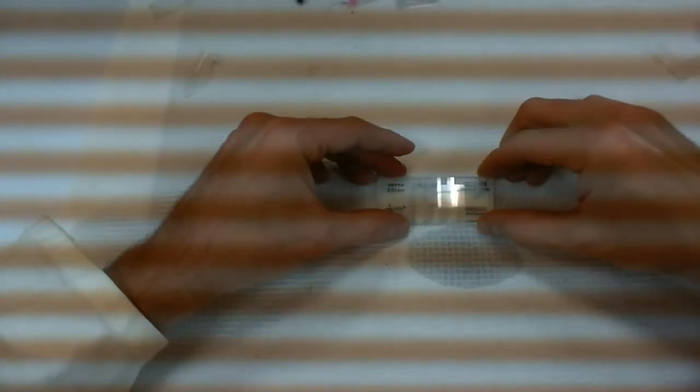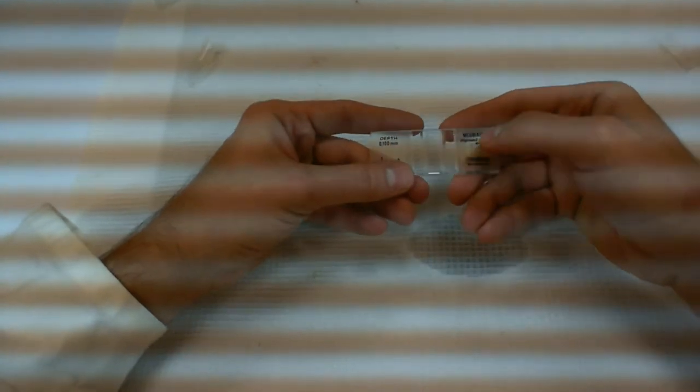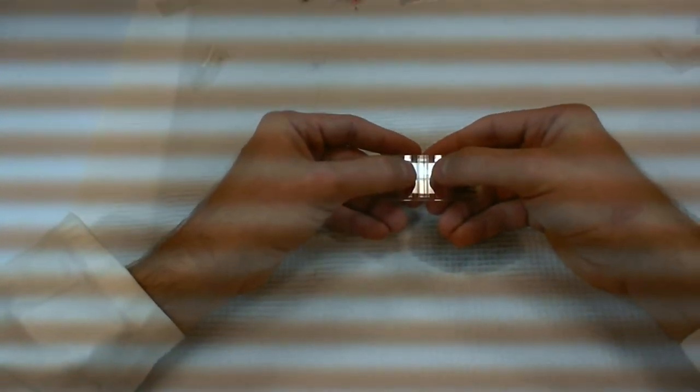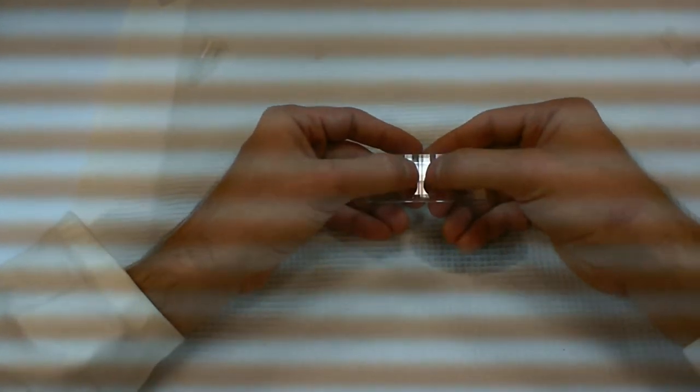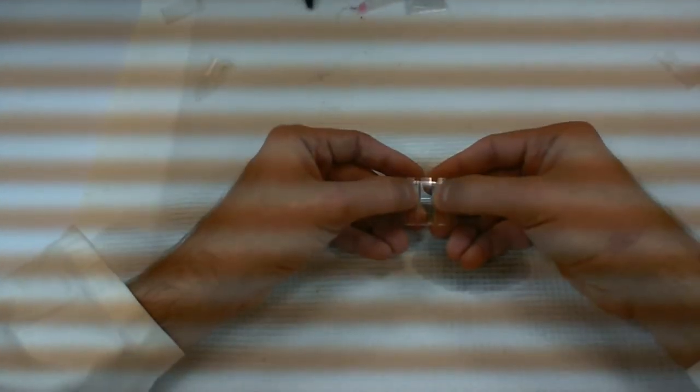And I'm going to apply it. And so we can see the cover slip is on there, and we're not quite there yet. What I'm going to do now is put my thumbs over the cover slip where the shoulders are, so not in the middle, don't press in the middle. I'm going to apply a bit of pressure, not a lot, and just move it back and forth.